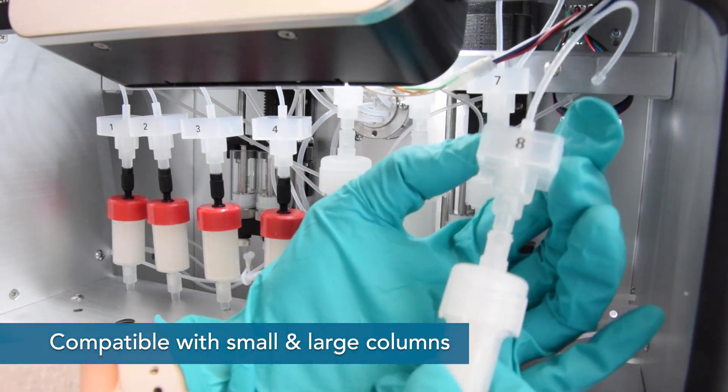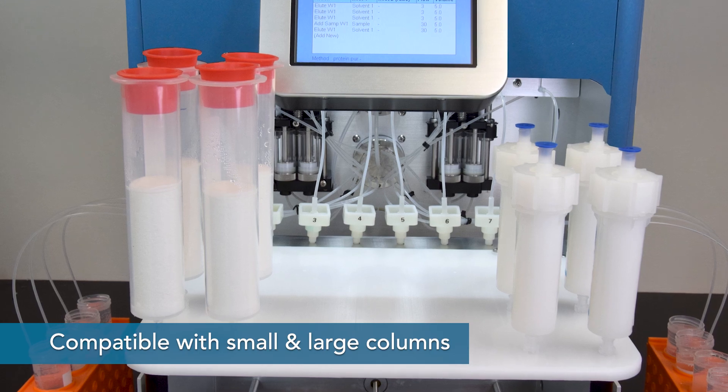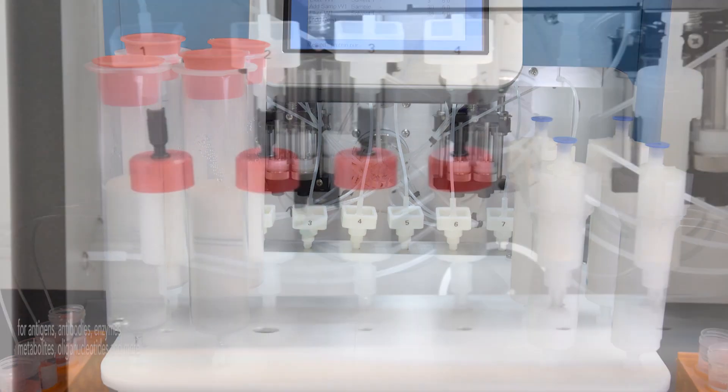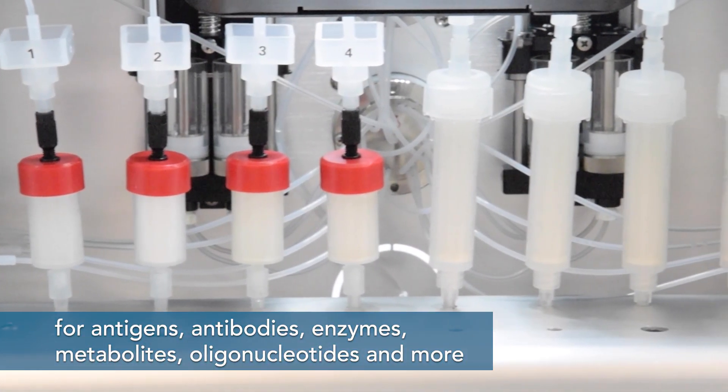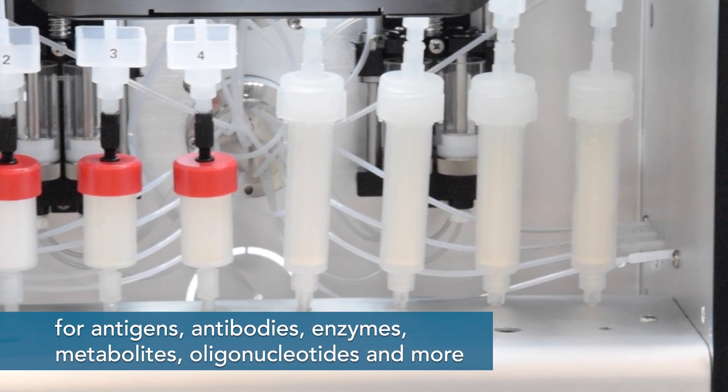The flexible design is compatible with a range of column sizes, from 1 milliliter to 70 milliliters, allowing the purification of antigens, antibodies, enzymes, metabolites, oligonucleotides and more.